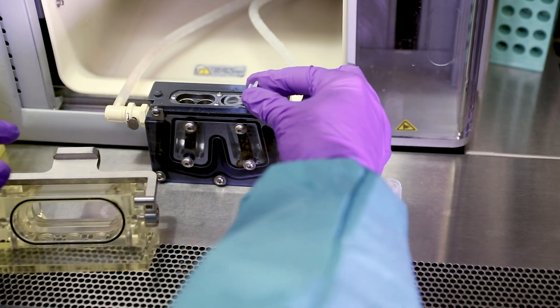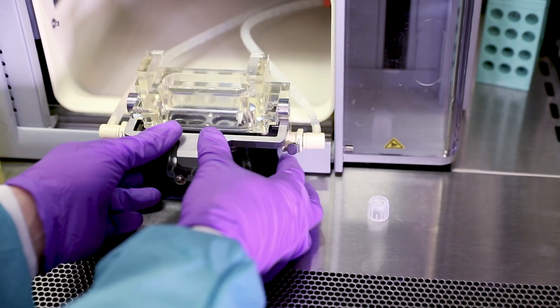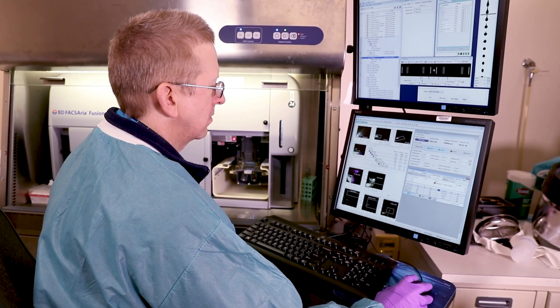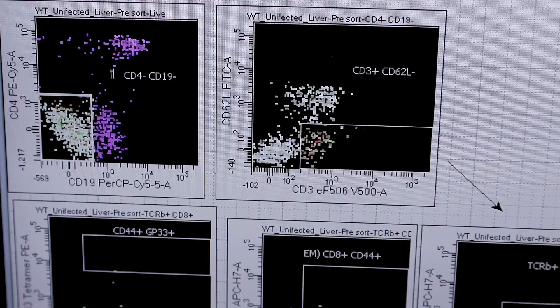We can identify these cells and then separate them out using cell sorting to allow the investigator to do post-sorting functional assays and genomics assays in order to further elucidate and define what this cell is and what is the mechanism by which it causes disease.